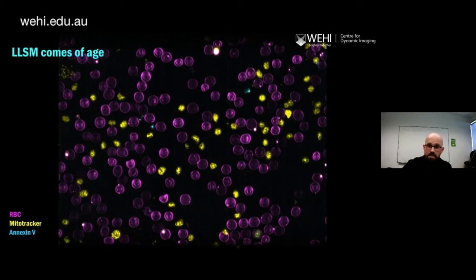If we play that back, you can actually see where the invasions occur. There's one there, there's one there, there's one there, there's another there, and there's another there. Now that's 5 in just one 20-minute run. And if you were to get 5 in a day on the other system, you would have heard dancing and singing coming from the room.